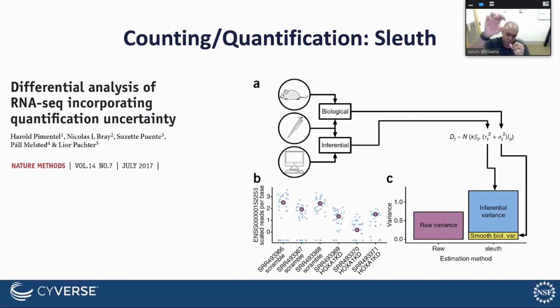The other half of this workflow, so the Kallisto workflows you'll see in a bit, just deals with counting the reads and doing the quantification. The Sleuth workflow then takes all of your individual experiments, so all of your different replicates and conditions, and develops a linear model. This linear modeling and visualization that we'll do in the second half in R and Sleuth allows you to separate out variance that's due to technical variance and really isolate, hopefully, the biological reason for the difference of two samples, or however many samples you have.